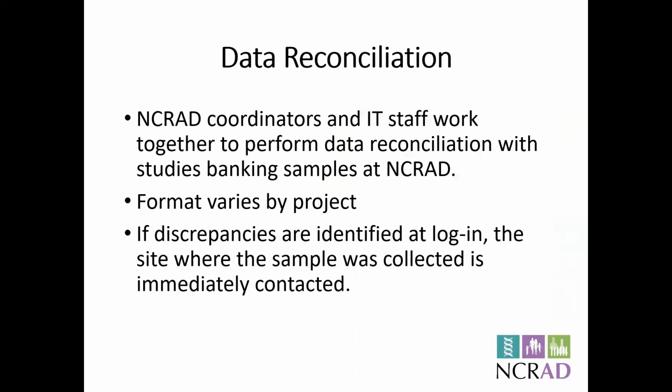We perform data reconciliation. What that means is NCRAD coordinators and our IT staff here work together to perform data reconciliation for all the studies banking samples at NCRAD. The format varies by project depending on the data we receive, but we also try to resolve all discrepancies that are identified at login. So we'll contact the site where the sample was collected and immediately try to resolve any issues that we see on forms, on sample labels, or anything that doesn't meet the requirements of the study protocol.